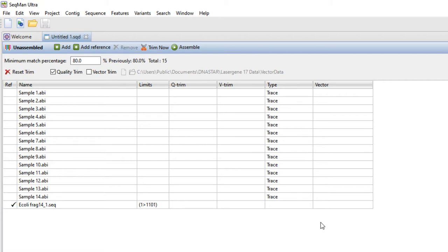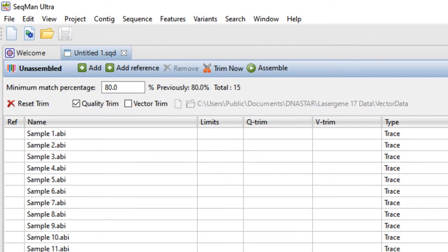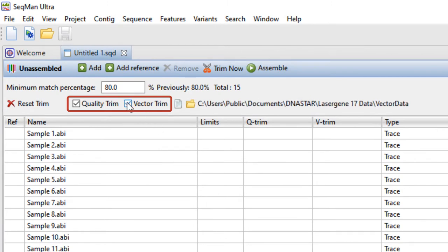To have SeqMan Ultra automatically trim read sequences based on quality and or the presence of vector, check one or both boxes. By default, SeqMan Ultra will use the installed vector catalog to detect vector sequence.